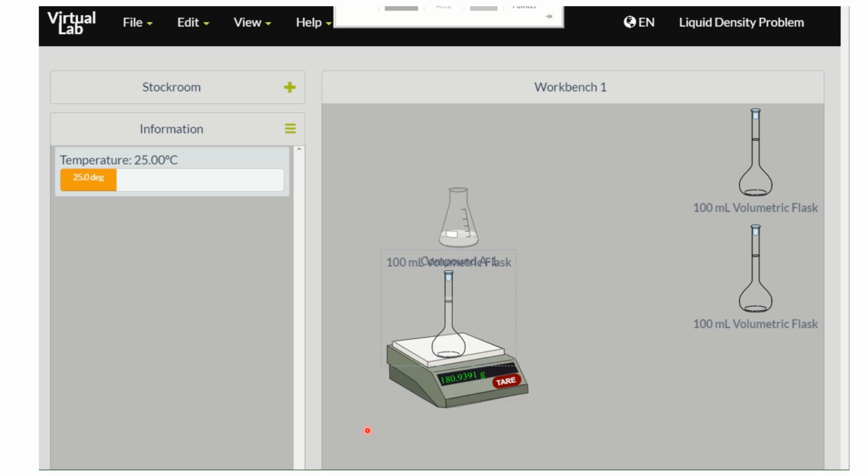And yes, so from here you repeat this process. You repeat it 3 times for compound A1, you repeat it 3 times for compound A2. So just make sure you keep your stuff separate. Don't get these volumetric flasks confused. Once I'm done with this one, I would probably pour my stuff back and then get rid of this one. You will right click it and then just click remove and then just work with the other two, just so that you don't get confused.